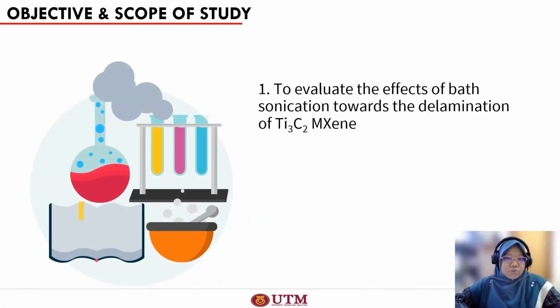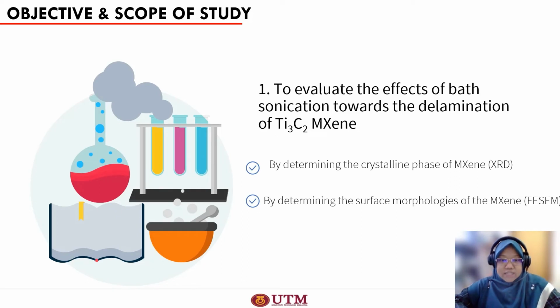So we go to the objective and scope of our study. As I mentioned before, the main objective of our research is to evaluate the effects of bath sonication towards the delamination of titanium carbide MXene. We are going to evaluate the effect through characterization, by determining the crystalline phase of MXene through XRD, and by determining the surface morphologies of the MXene via FE-SEM analysis.